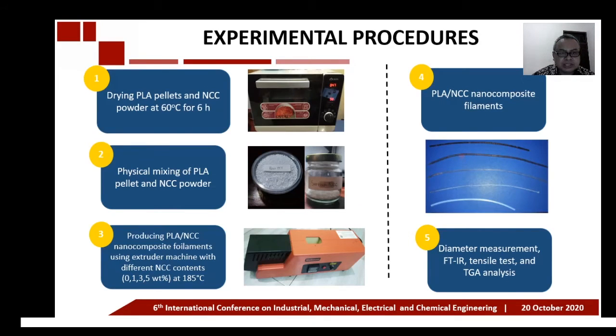So this is the experimental procedure. We started by drying PLA pellets and NCC powder at 60 degrees Celsius for 6 hours. This drying releases the water absorbed in the PLA and also in the NCC powder. And then we do particular mixing of PLA pellets and NCC powder.